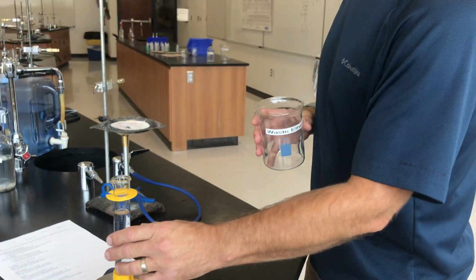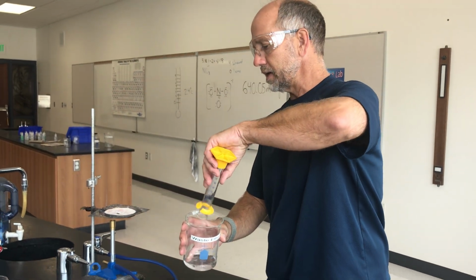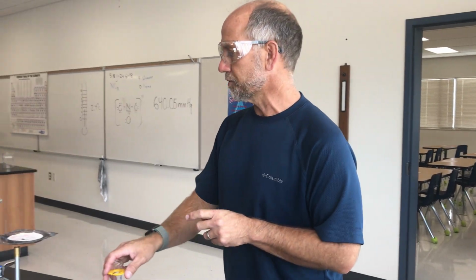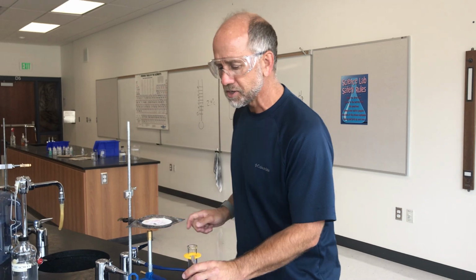Okay, so now we're done with our 3 liquids. We will actually collect our ethanol in a waste ethanol beaker. That does not go down the drain. And at this point, we're now ready to do our 2 solids. As you know from the pre-lab discussion, the way that we handle the solids are a little bit different.